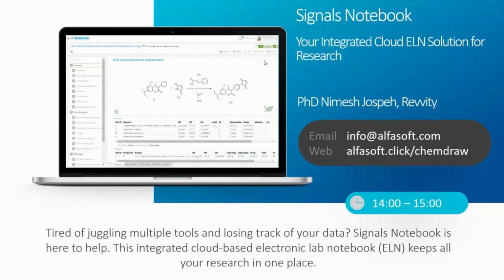Are there any data processing and analytics capabilities within Signals Notebook?